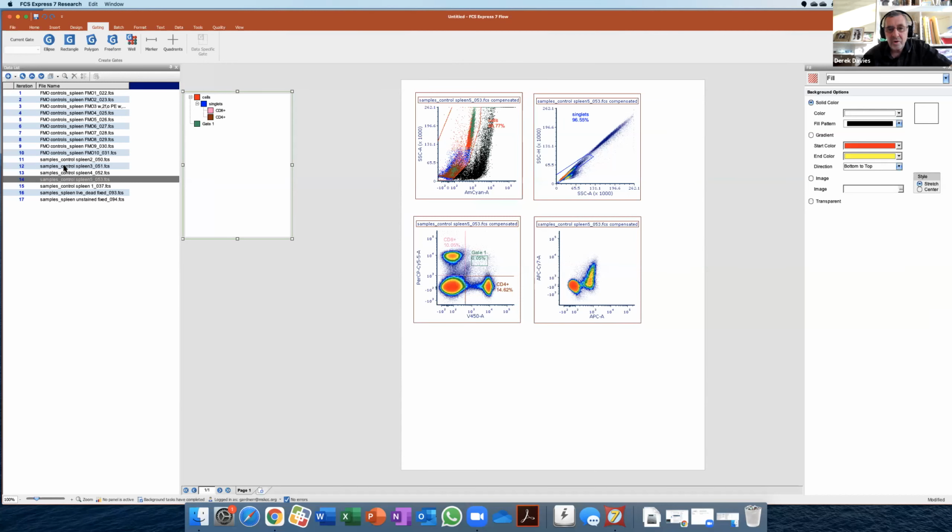Yeah, exactly. I think if you've got the odd outlier, you're in a bit of trouble, and it's maybe a compromise too far to do that. Yeah. In that case, you try to use a tissue that's as similar as possible, but still, yeah, it will be difficult to have the right FMOs, and that's why it's also very good to have things very well titrated and make sure that you're pulling out the populations as well as possible. Because one of the things we have to understand is that these are the limitations of this technique, right? And we have to be careful not to abuse, especially because there is some subjectivity there.